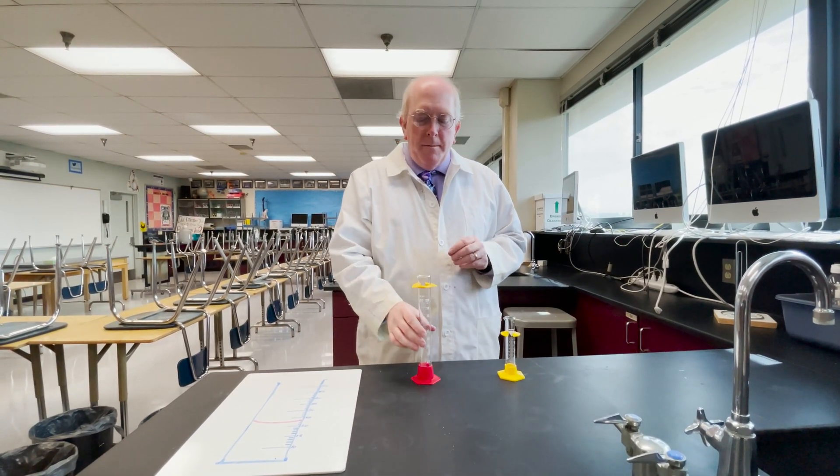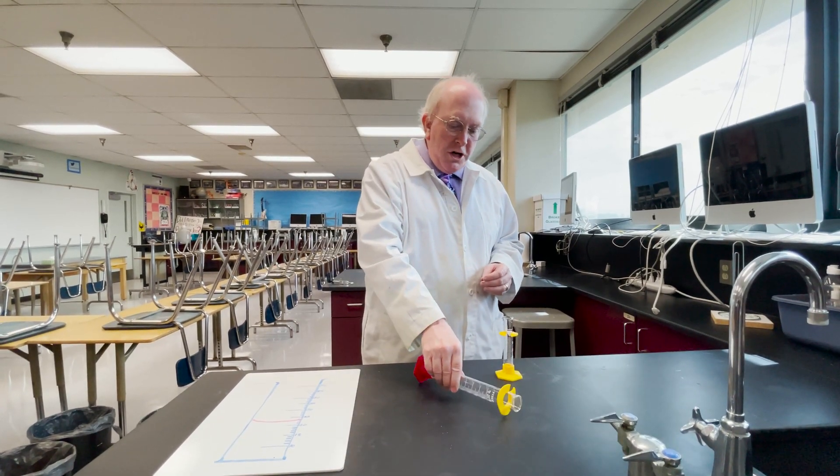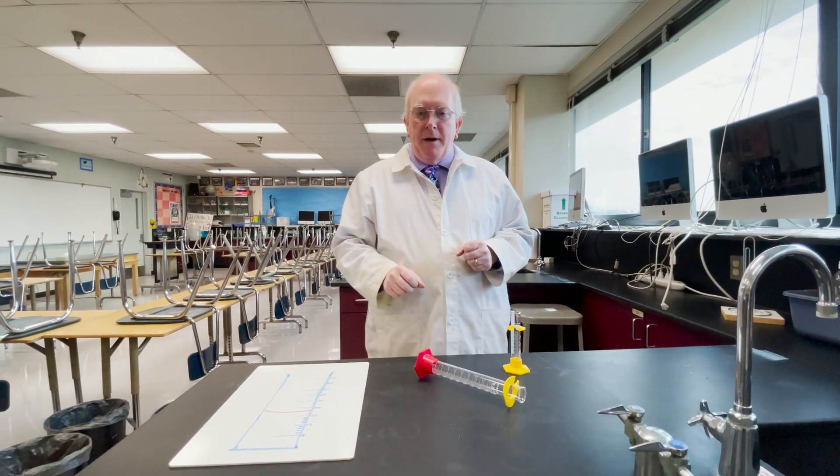Please always remember that the plastic rings on a graduated cylinder are a shock absorber. Always keep them up at the top — if the cylinder gets knocked over, it helps to prevent breakage.